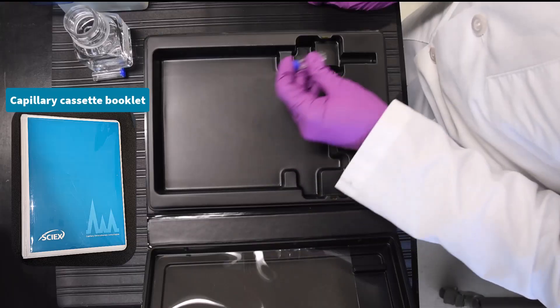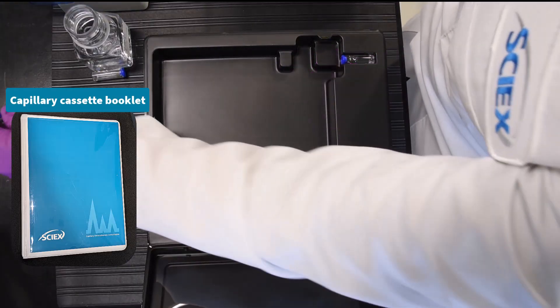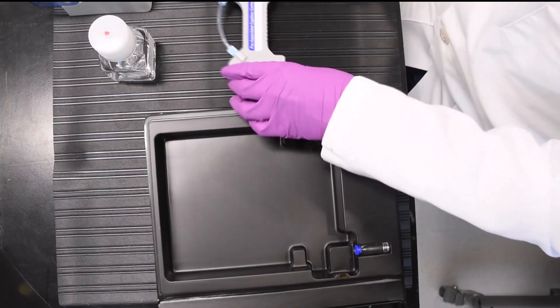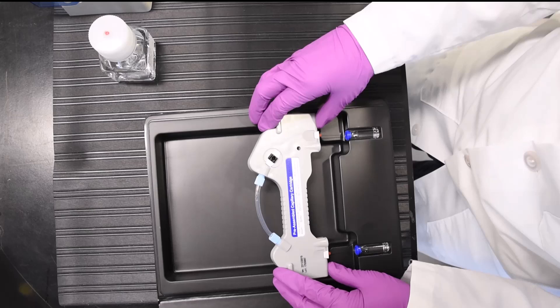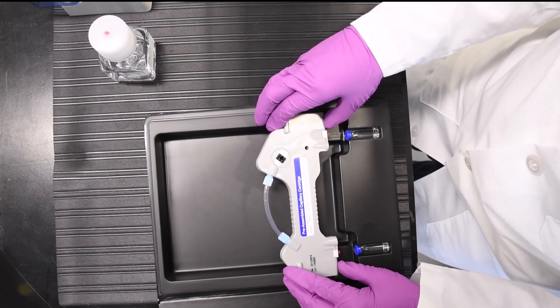Then, place them into the base of the capillary cassette booklet. Next, carefully insert the capillary cartridge assembly face up into the grooves of the cassette booklet.